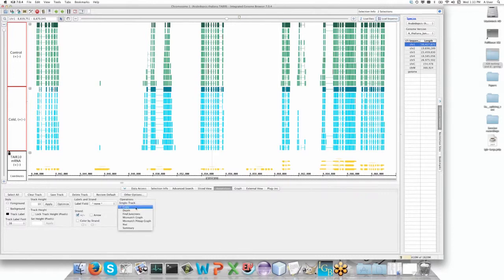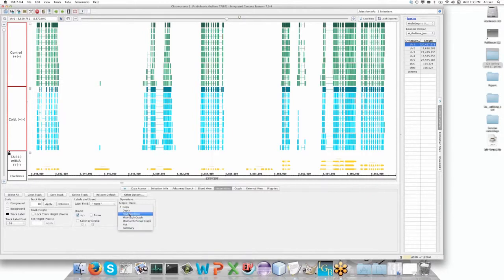The single track functions are things like copy this track, show me only the mismatches but in a graphical format, or show me all the region that does not have annotated material. The ones we're going to focus on now are Find Junction and Depth, and I'll explain them as we begin to look at them.